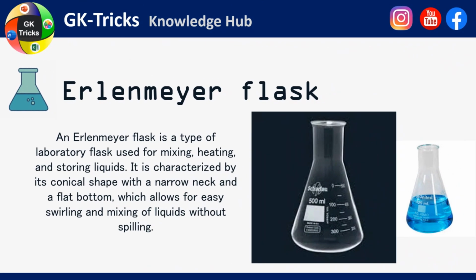Erlenmeyer flask. An Erlenmeyer flask is a type of laboratory flask used for mixing, heating, and storing liquids. It is characterized by its conical shape with a narrow neck and a flat bottom, which allows for easy swirling and mixing of liquids without spilling.